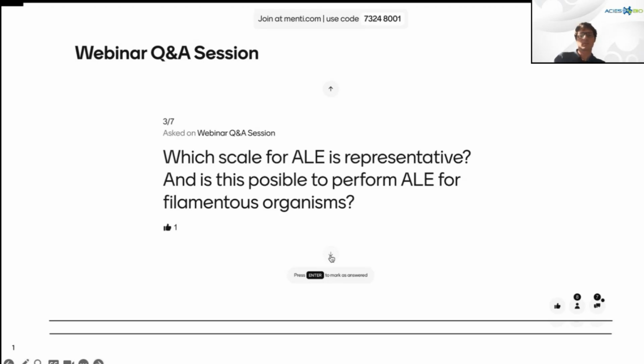Work with filamentous organisms, of course, is different in many ways from working with, I would say, classical bacteria. You have to take into account the physiology of the growth, but also that if you have a mutant, then you need to usually go through some sort of single cellular form like a spore, which then takes you to the next generation. Yeah, so the methods have to be adapted, of course, and as Dusan mentioned, it also takes a little bit more time when you work with such organisms.